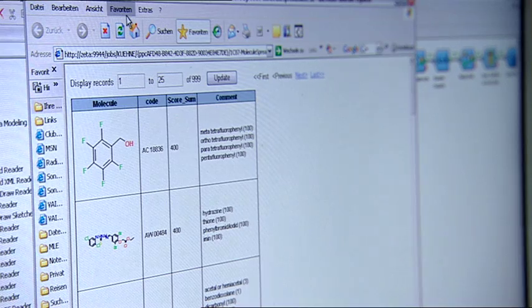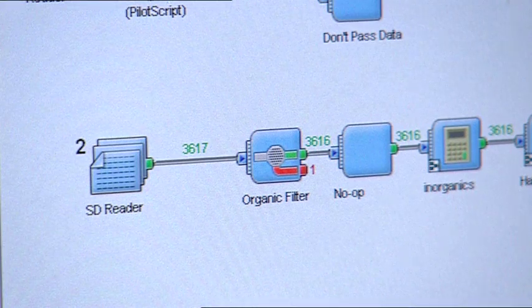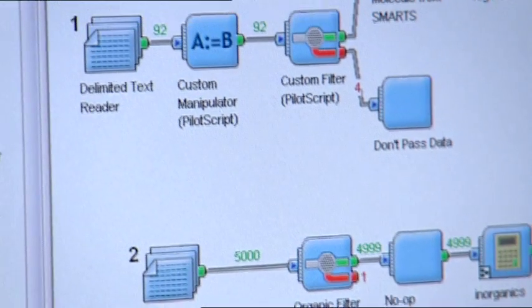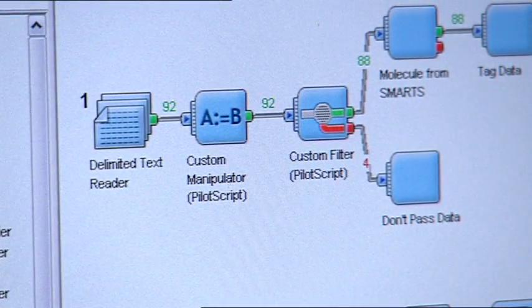When the tests are completed, Dr. Ronald Kuhner from the research group Drug Design analyzes the data using special programs that are also used for developing medication. Kuhner and his team support the screening unit with the automated data collection and computer-aided chemistry.